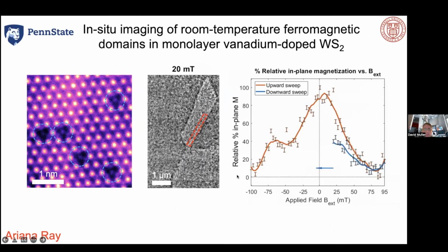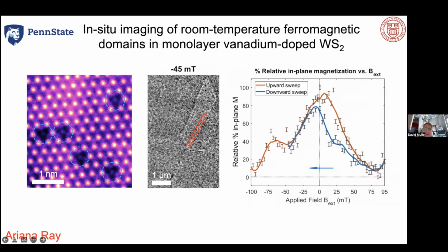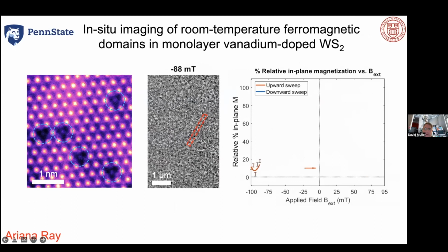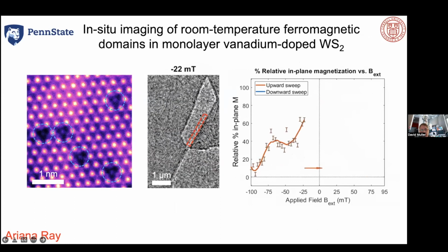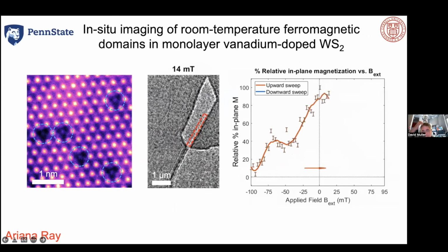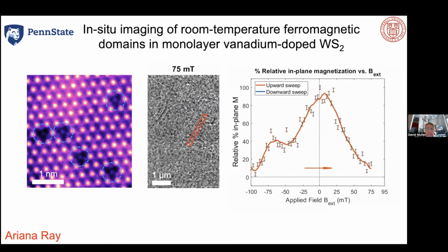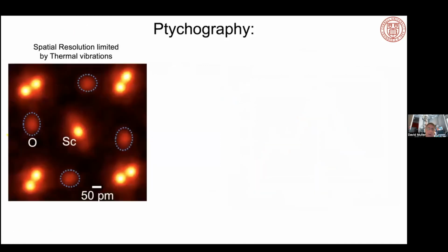And then if I sweep the magnetic field and take an image, you can see the contrast coming in and out from a grain that's doped optimally to produce magnetic contrast. And so as I sweep back and forth, you can see the contrast as I pull the spins in plane and out of plane. So that's imaging from a single, this is a monolayer. This is a material that's only 1 atom thick. So this is contrast from a monolayer of spins.